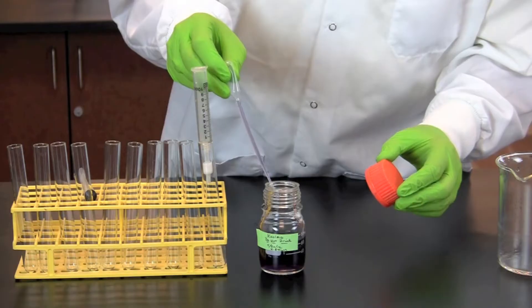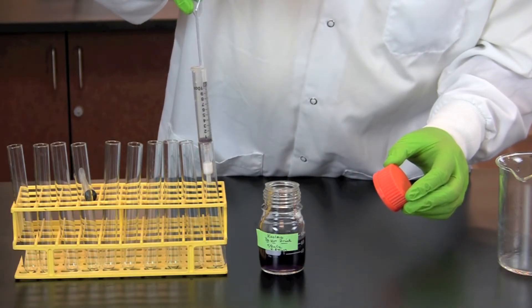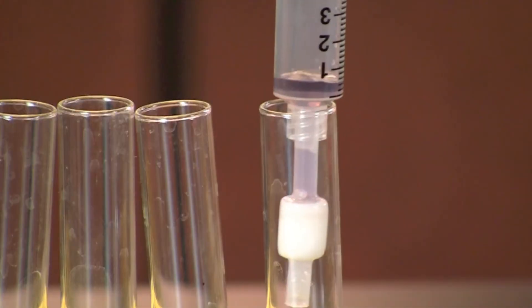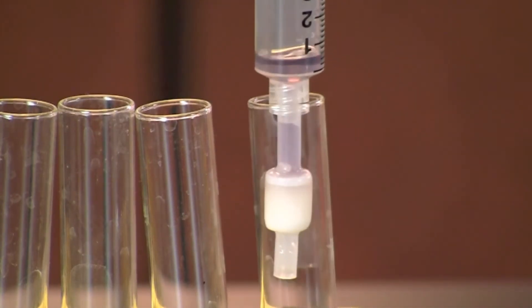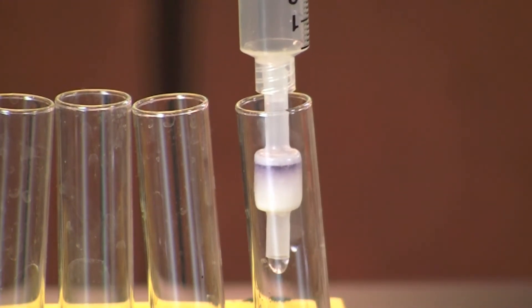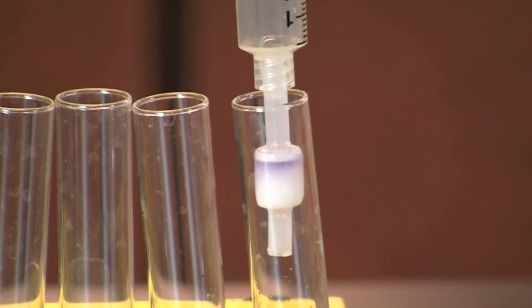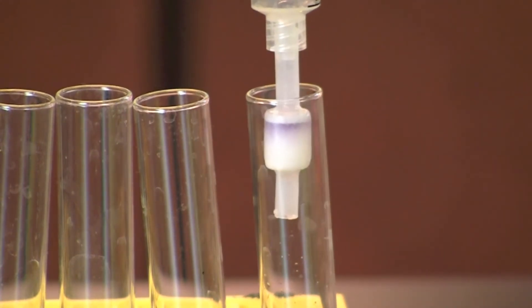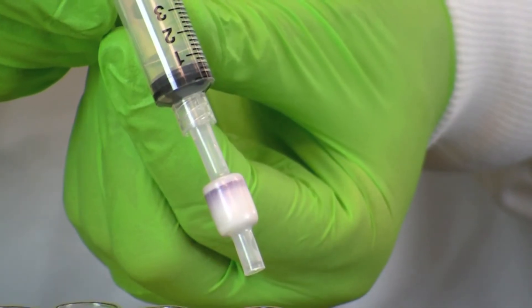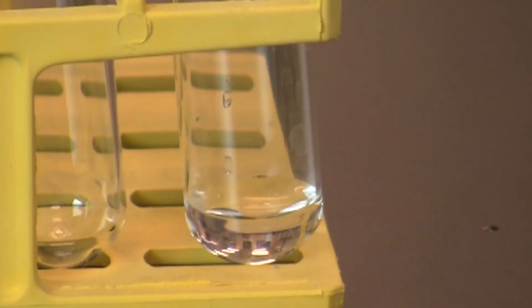Using a transfer pipette, add 1 ml of Kool-Aid solution to the syringe. Replace the plunger and push the Kool-Aid through the cartridge. Collect the flow through in test tube number 1 and save it for analysis. Notice that the pigment portion of the Kool-Aid has stuck to the column, indicating that it is non-polar and hydrophobic. Note the color of the fraction collected in test tube number 1.